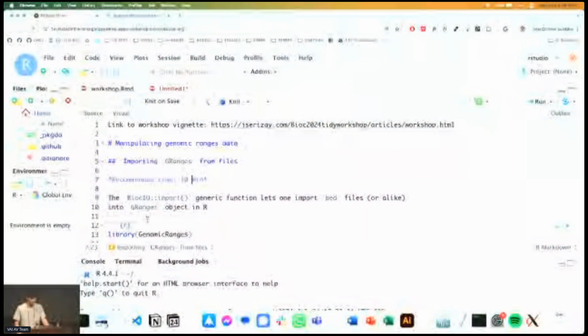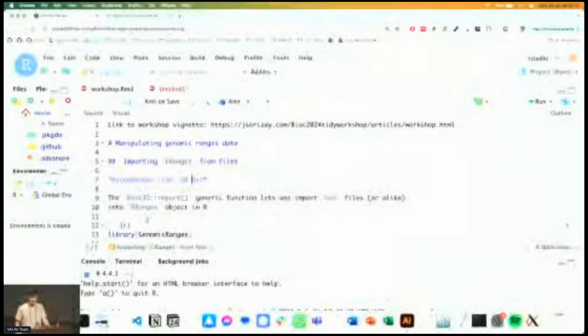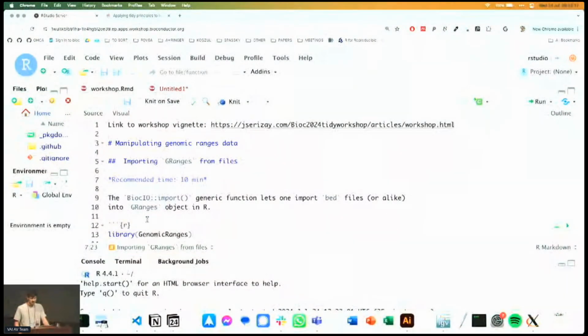Probably some of you at least have used the tidyverse packages, including dplyr, tibble, tidyr. These different packages provide these operative verbs to manipulate standard tabular data, namely data frames.